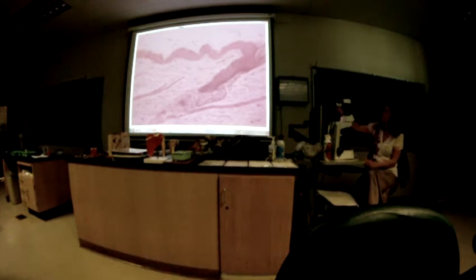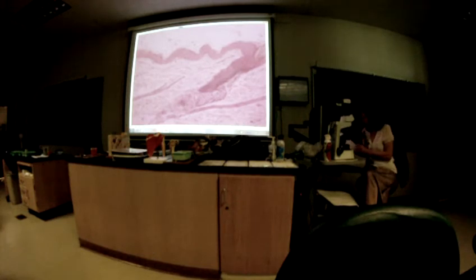All right, what's this mound-like structure right here? The little hill that goes up. Yeah, papilla. The papilla. Yeah, that's the papilla. The dermal papilla or just papilla? Dermal. It is dermal, I'm sorry. Papilla just means little hill. That's kind of a general term. It is dermal, thank you. I don't have my list in front of me and I totally forgot that. It's dermal papilla.